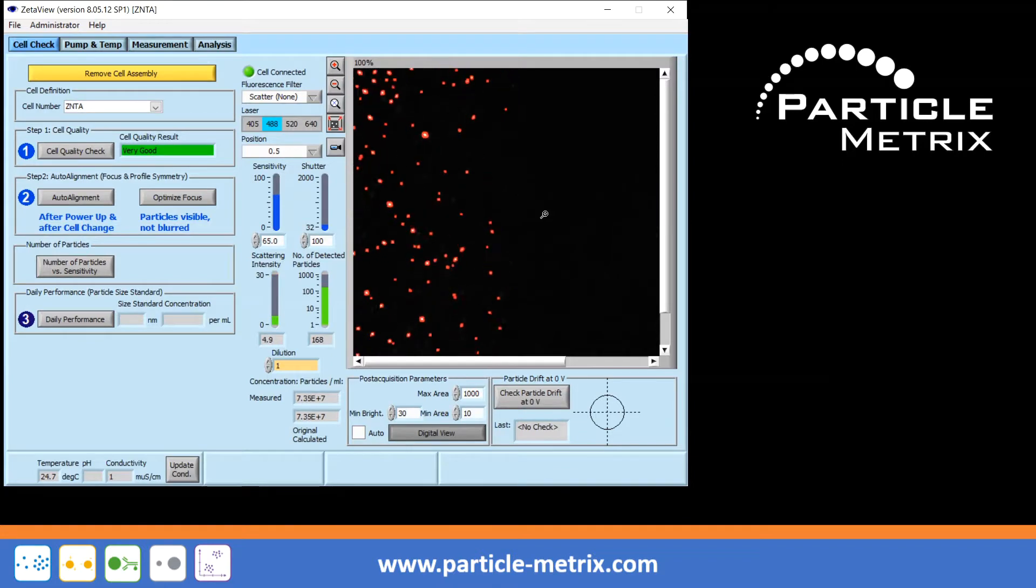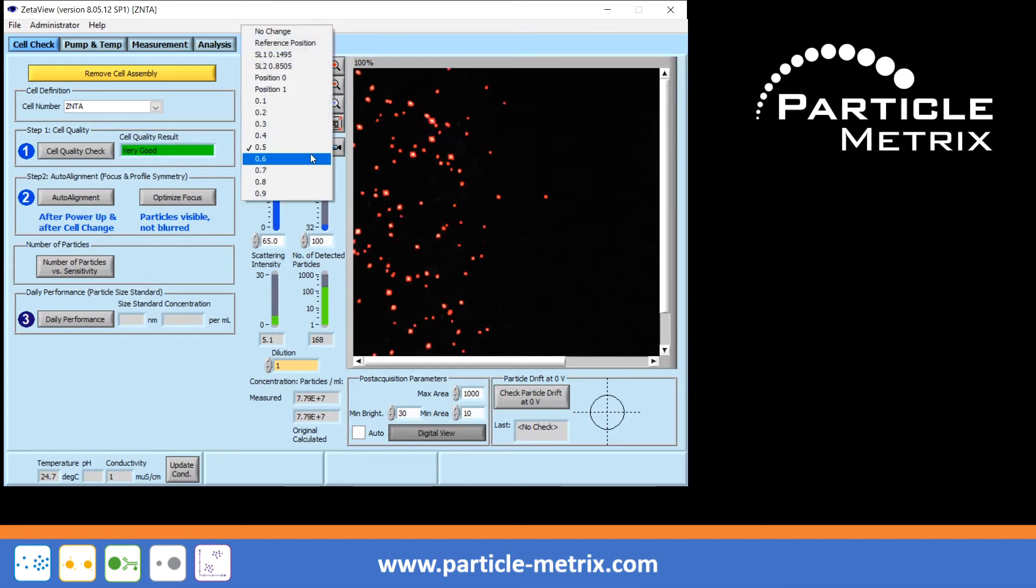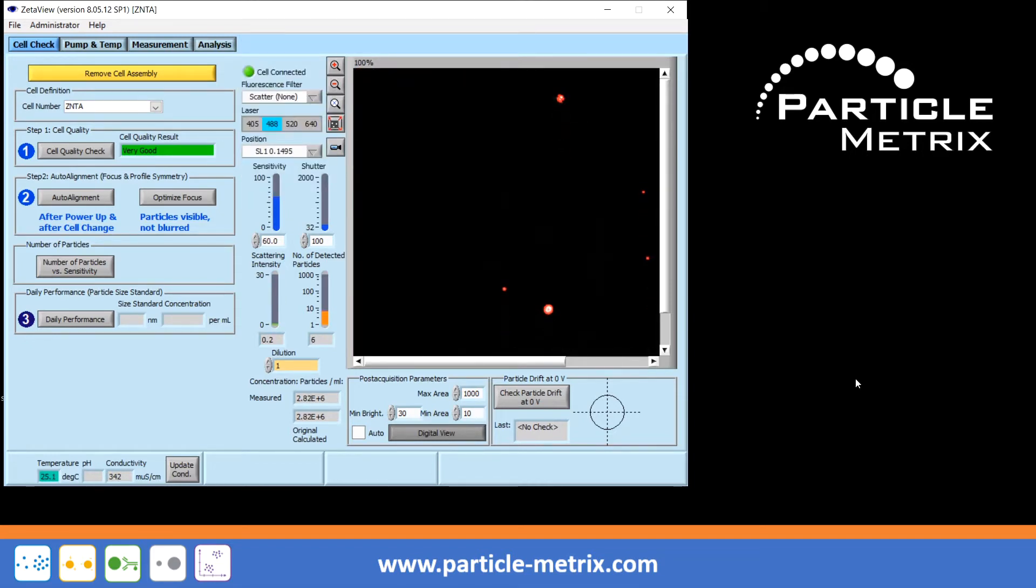If the field of view is only half filled with particles, this may also be an indication of an air bubble in the measuring cell. In addition to a reduced or insufficient number of particles, air bubbles that cannot be seen in the field of view can also cause drift problems.